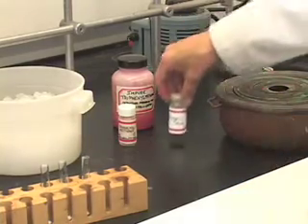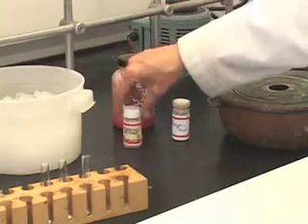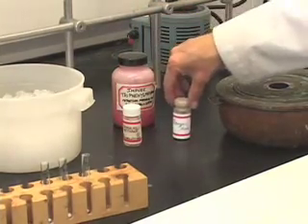Remember, you will be testing the solubility of the standard triphenylmethane. I am just using another sample.